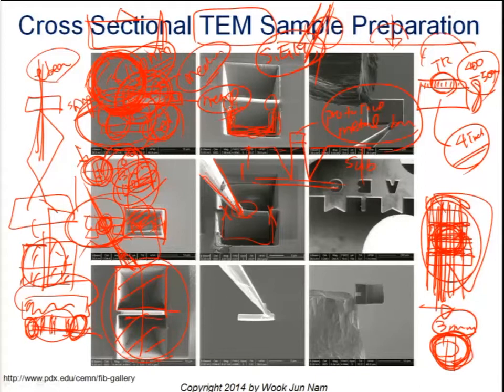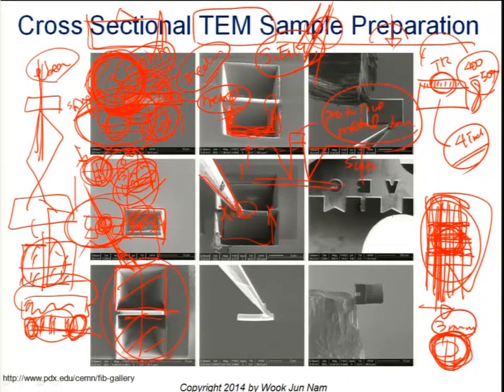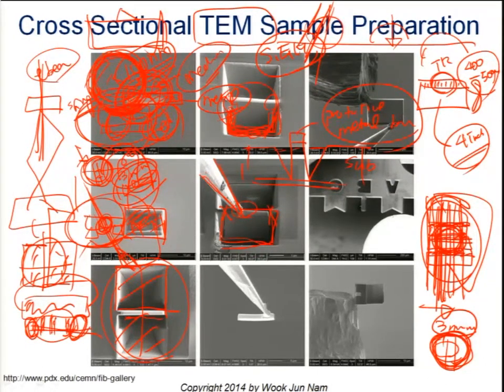And this thin piece of the sample already lost this kind of foundation on the bottom and then the side. So you can easily break these samples out. And then using that way, we can achieve this kind of thin piece of the sample, which is located where we are interested in the sample.